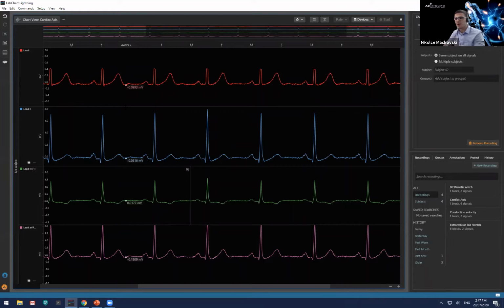If you're familiar with LabChart 8, you would have a folder with all your LabChart files, and that folder is usually called some sort of a theme. Maybe it's a chapter in your PhD, or maybe some sort of a grant or something like that. This is the preliminary data. But within that are all your LabChart files. So projects are simply used as a way to group the theme of the data sets.